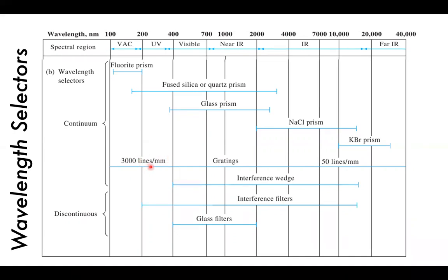These can be used to disperse the light. What happens is the light interacts with the line, and because the line ends up being of a similar size to the light's wavelength, that disperses it, causing different wavelengths to be reflected at different rates.